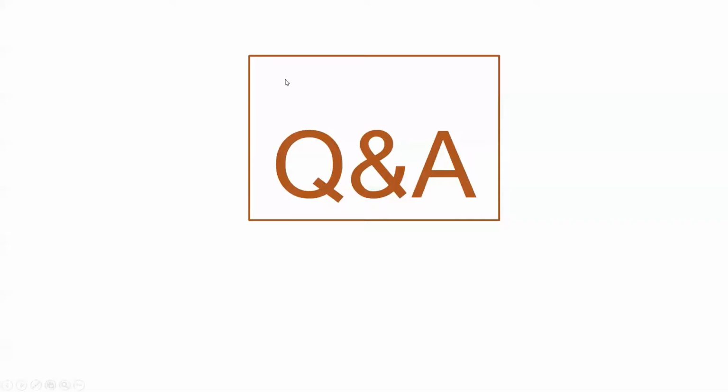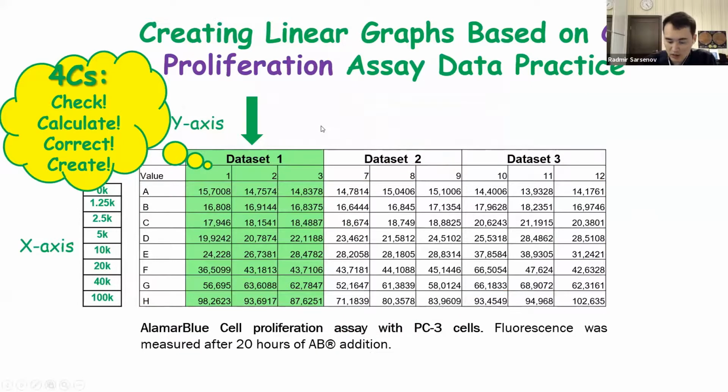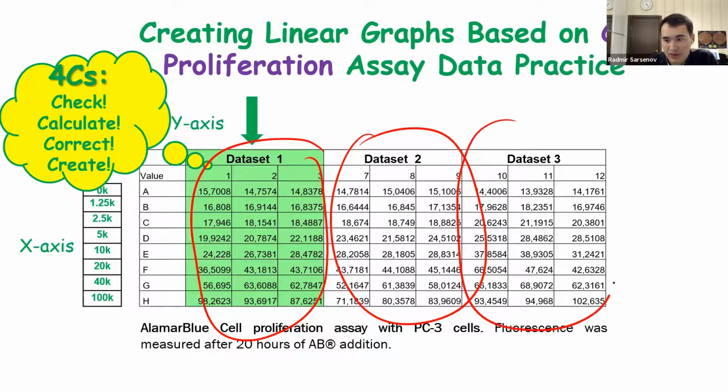Can you explain again about SD, standard deviation? And should we do it for all groups? I mean, 1 to 13 or 1 to 9? Can you open the table? Which one? 1 to 12. Yes. So for these three, you are going to perform the same calculations.